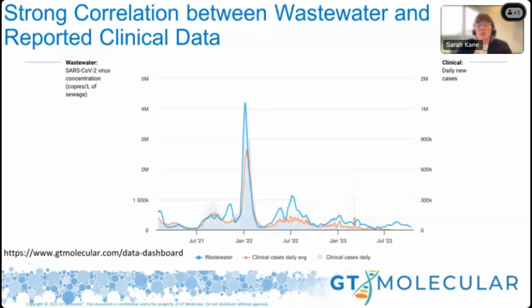And then we were trying out all of these different concentration and extraction workflows. And then I actually met with a couple folks down in Las Vegas and asked, what is your approach? You guys have successfully detected it. And what it came down to was the workflow.